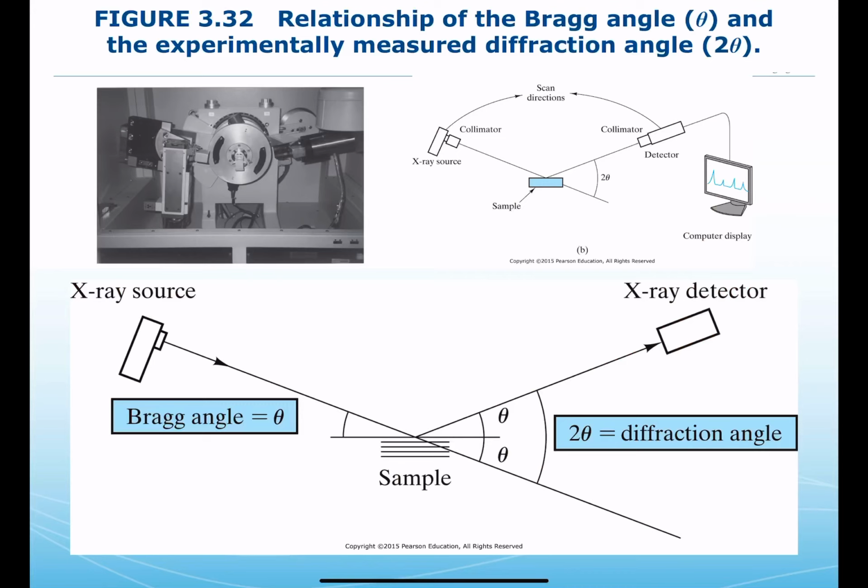Okay. So with the fundamentals in place now, we can consider the instrument a little bit. So we saw we were going to take a radiation source, a wide beam of all the same wavelength of the incident X-rays is going to be imposed onto the sample. The sample will have a surface which helps us establish the angle of incidence, also called the Bragg angle, theta.